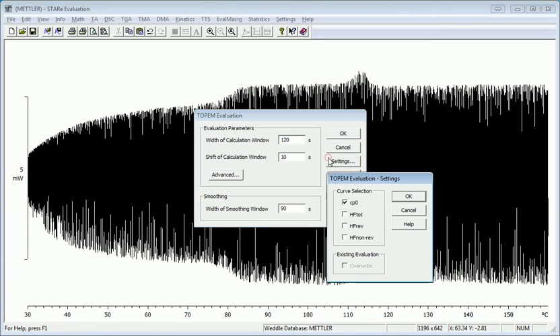The one thing I do check is in the settings menu. You can go here to select whether you want to show CP0. That's the heat capacity at zero hertz.